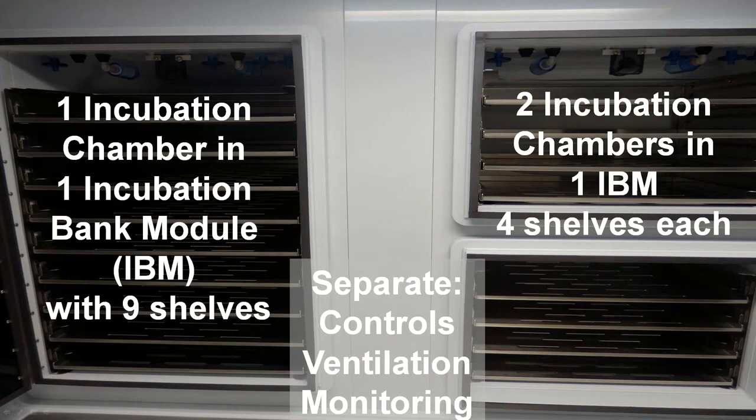So an incubation bank module can have one big incubator like you see on the left here, or it can have 2 separate incubators like you see on the right. We've even done some with 3 separate incubators. It depends on what you need for your process.